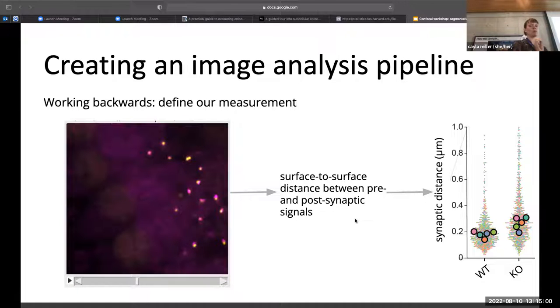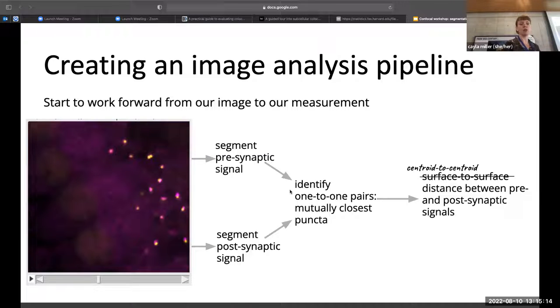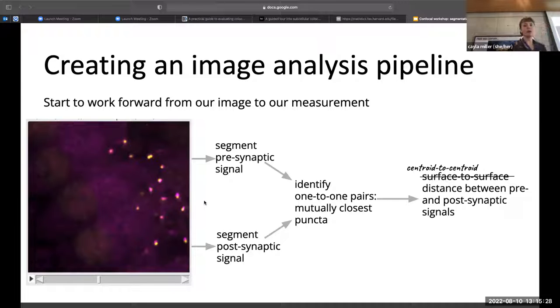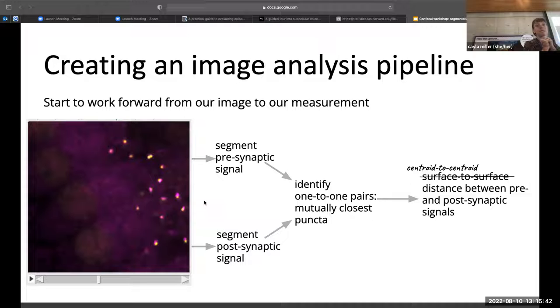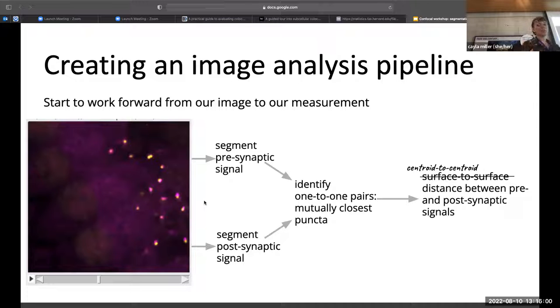Once we figure out what a synapse is, we can also ask: what is the distance? Are you measuring centroid-to-centroid or surface-to-surface distance? You can think about this in the context of the biology — what matters. You might find it's tricky to get accurate surface segmentation, so you end up measuring centroid-to-centroid because it's more accurate. It's a little iterative, but this is how I think about and try to go through the analysis process.